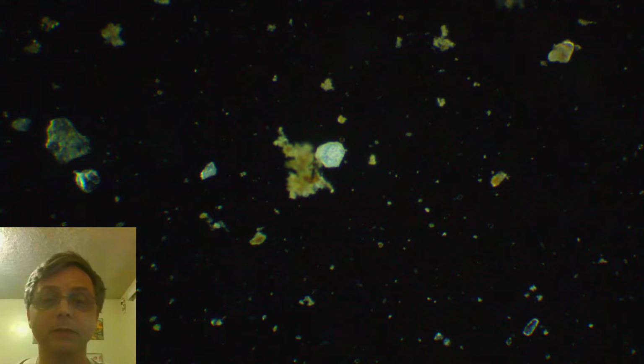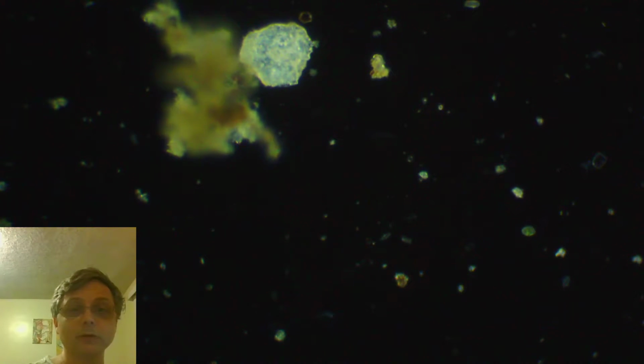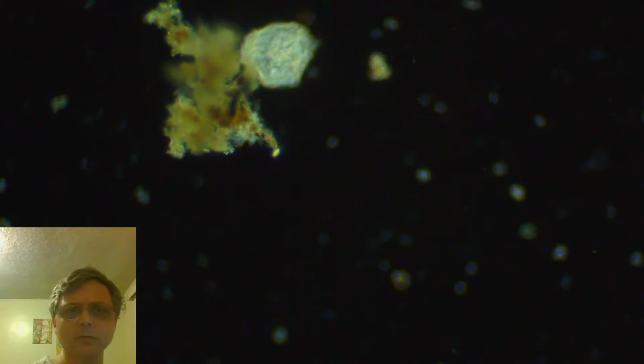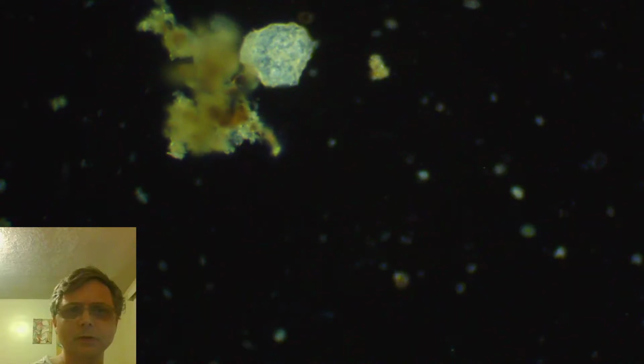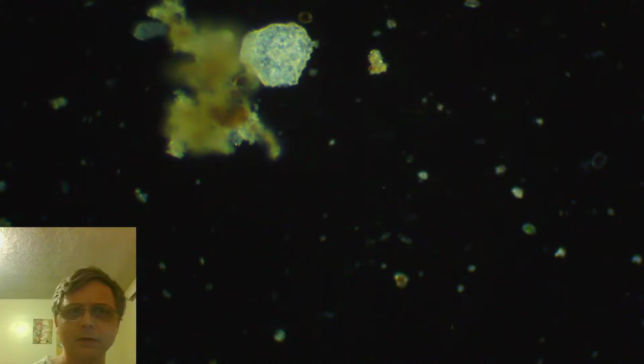There is another lumpy guy, a little lumpy guy. They're pretty cool to look at. Oh, wait a minute. Are you the normal lumpy guy or are you different? Should move around a lot. I believe that's a paramecium.